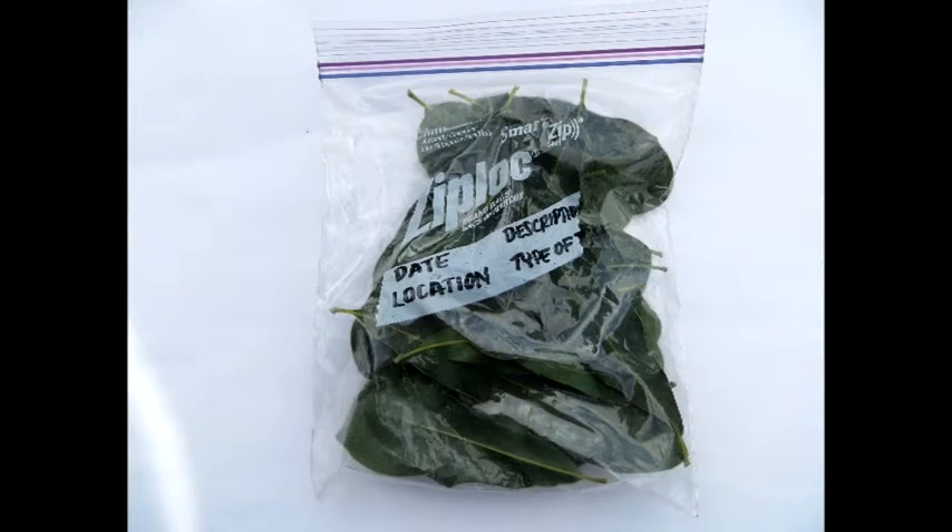Remember to keep your samples in a cool, dry place or in the refrigerator until you can take them to your nearest UH CTAH extension office. It is best to call and make an appointment to be sure that someone will be able to receive your samples.